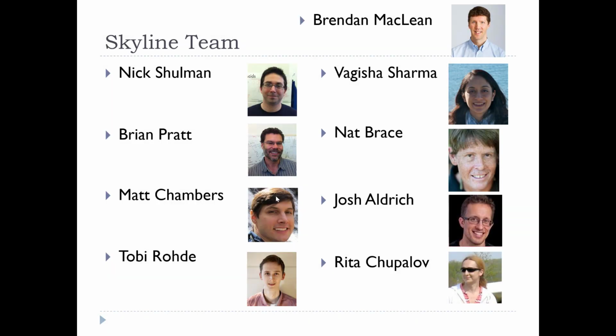This is the Skyline team right now. Many of whom are in Seattle, still working on new features.